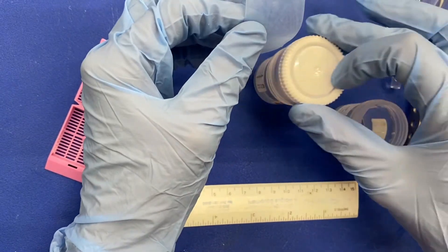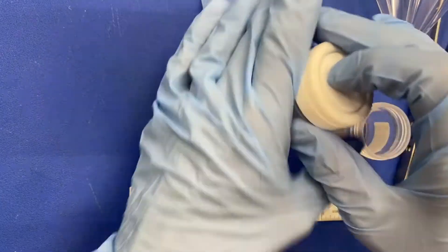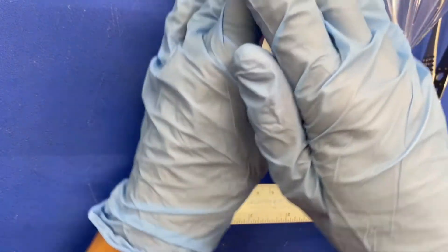Make sure you close the specimen container lid using ergonomic technique.